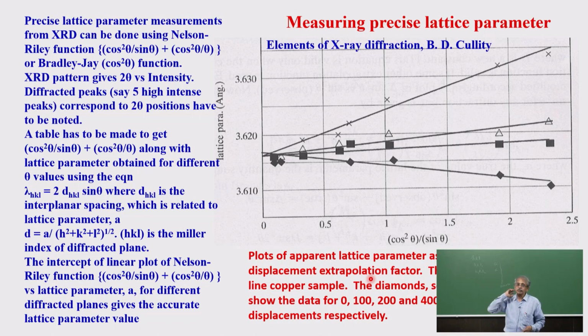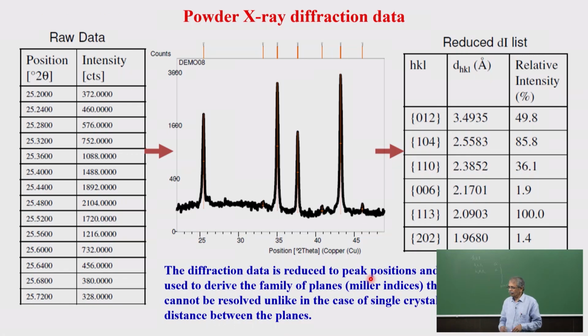And there are other methods also, called refinement. One can use certain refinement parameters and try to get that as well, which I have not shown in this because it's not very important.